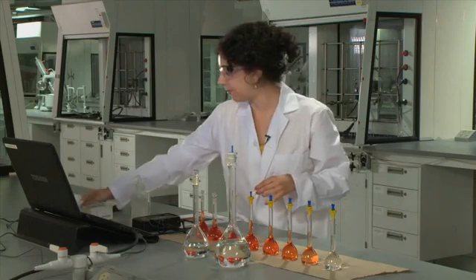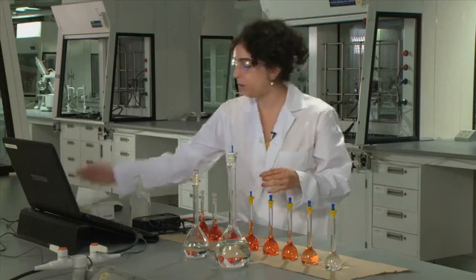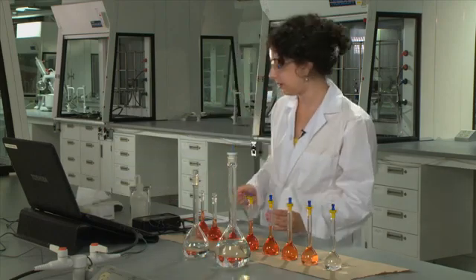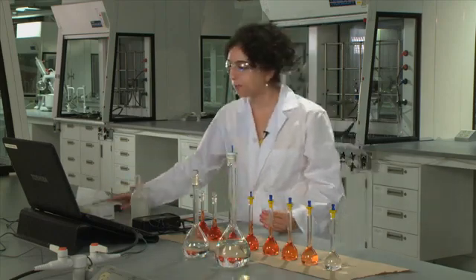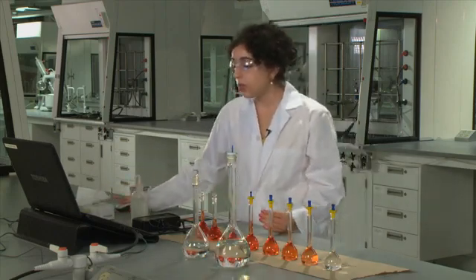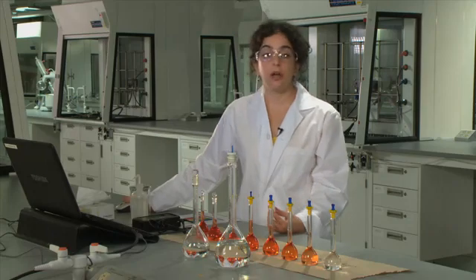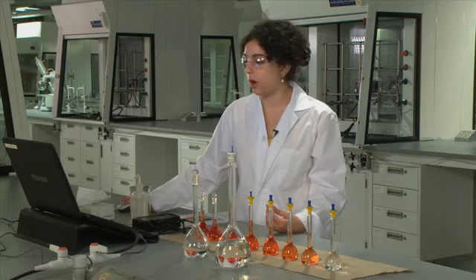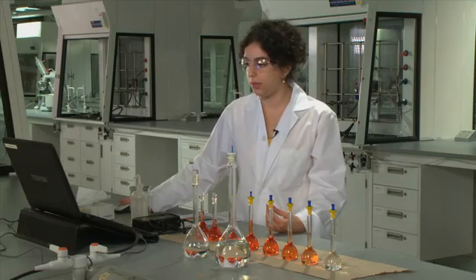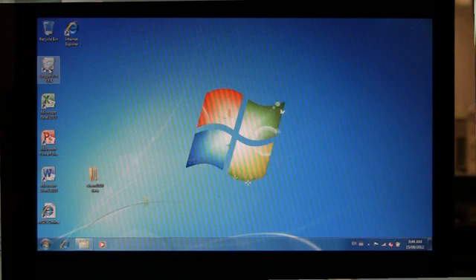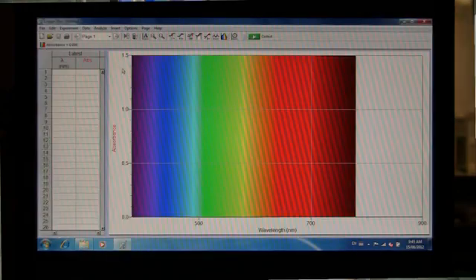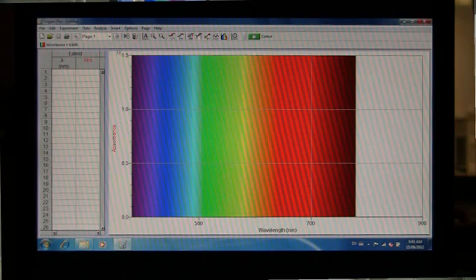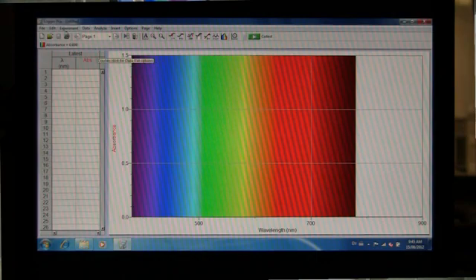So we're going to run some measurements. At the start of the lab, you'll want to start up the LoggerPro software that's located on the desktop computer.